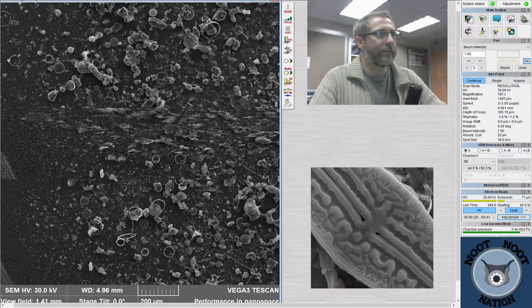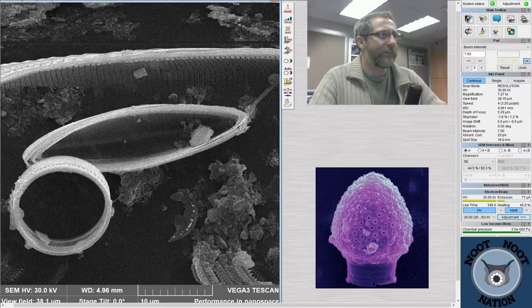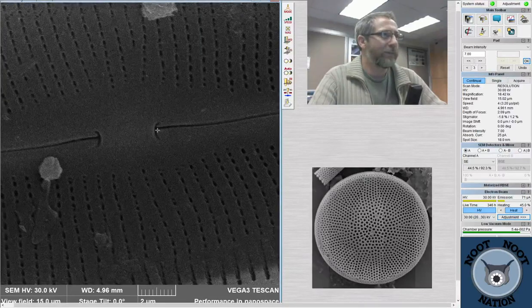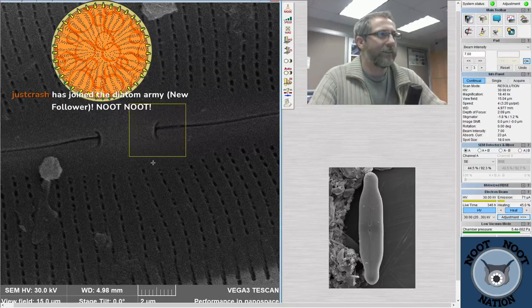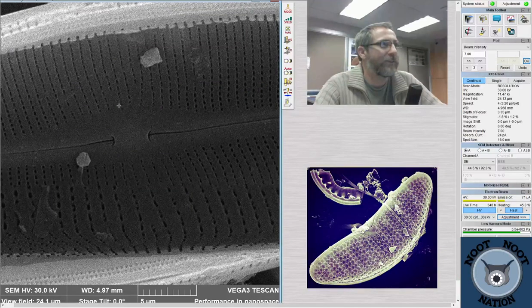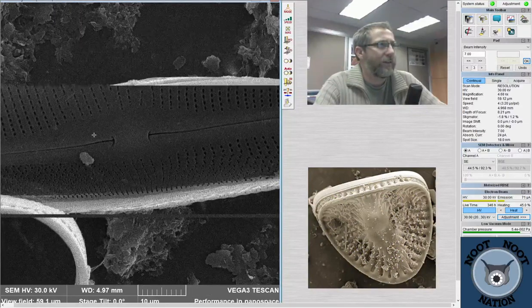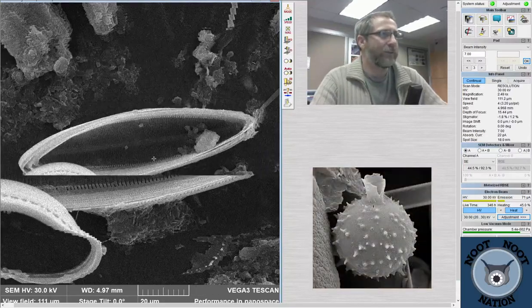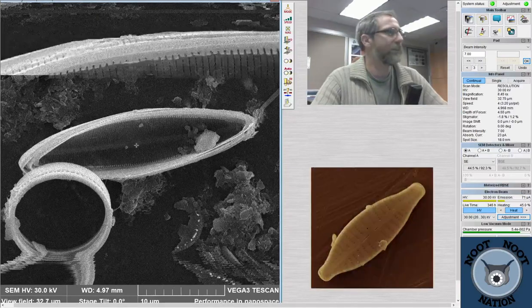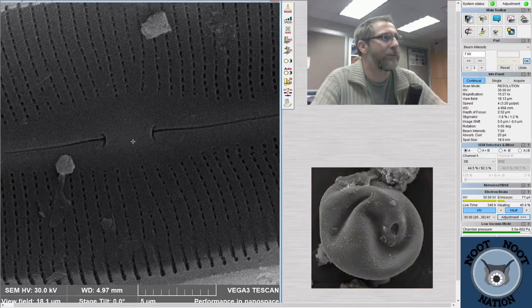This is something unusual right there, so I'll zoom in and look at it, and then we'll move over to the next slide. Oh, that's interesting. It's got little anchor-shaped ends to the raphe. I don't know what genus this is, but I should be able to figure it out, given a little bit of time, because those striae are pretty interesting little dashes, and then it has these anchor-shaped raphe ends. If it was asymmetric, I would go with something like Gomphonema or something, but that looks like it's actually twisted. So it's like a Scoliopleura or something like that. I don't remember the genus very well, but this is probably going to help us if we want to try to figure out what that is later on.